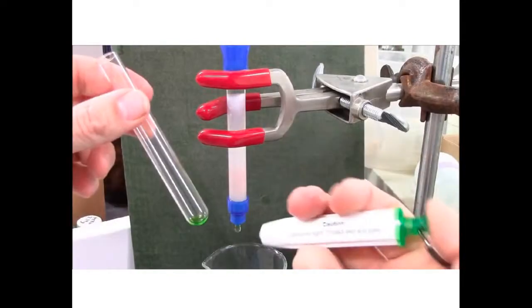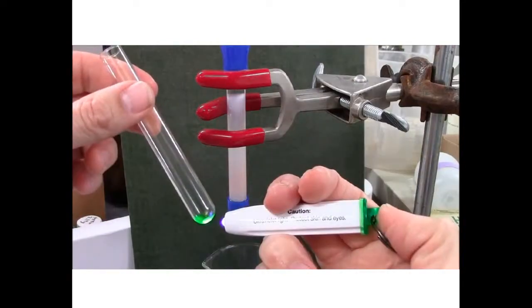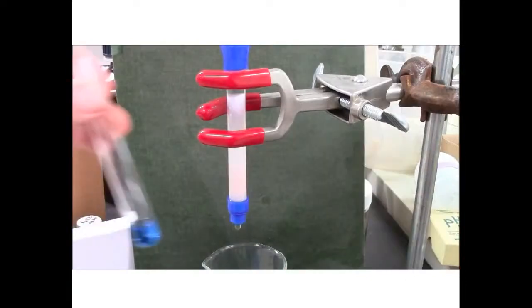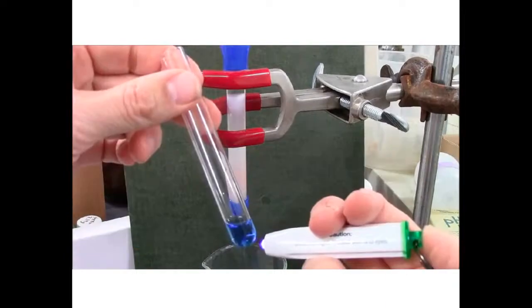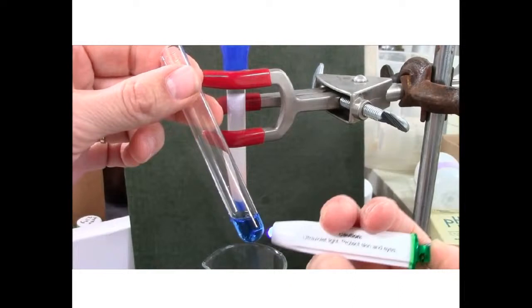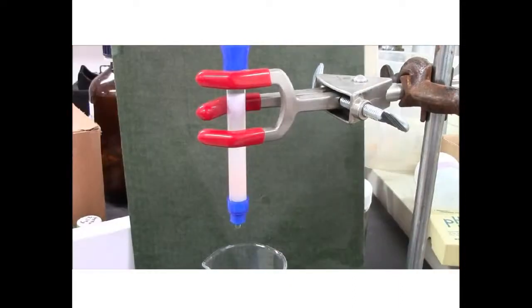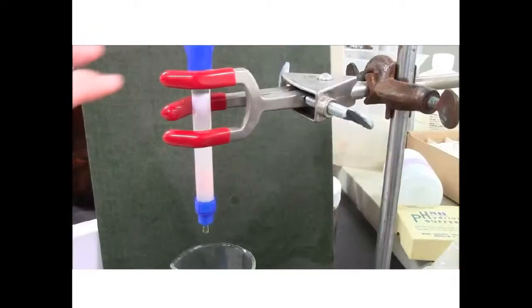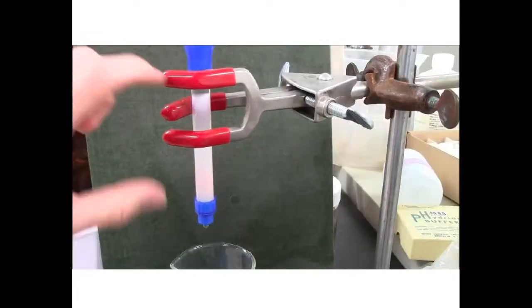The original mixture, you can see, glows nicely. And what I believe is isolated blue dextran from the column has no glow in the UV. That's a sign that I have successfully separated out all the fluorescein from the blue dextran. So the column, if I've done it well, comes out completely colorless.